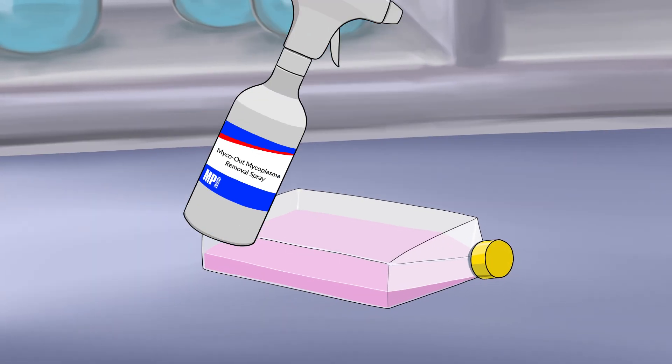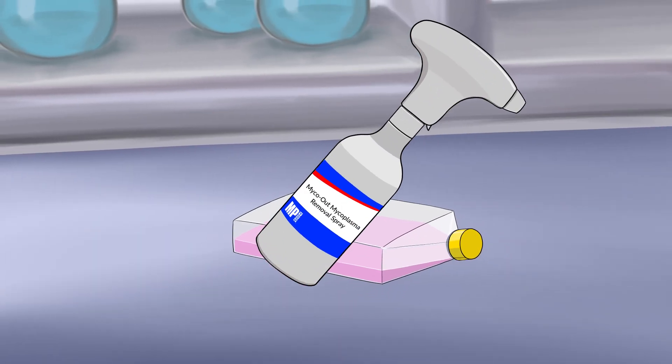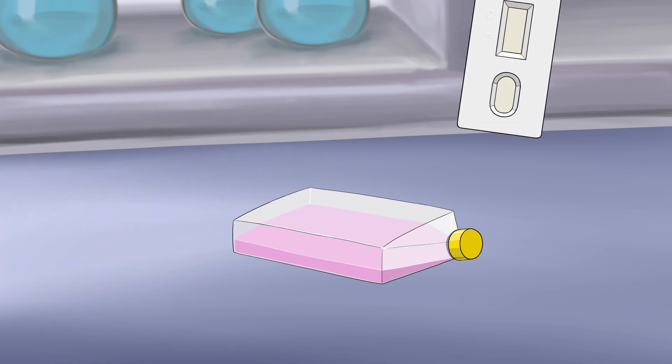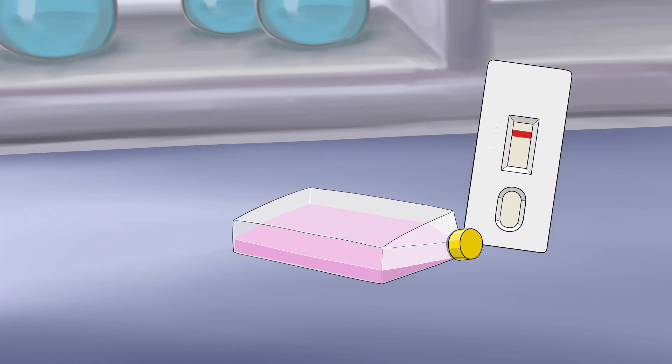Don't forget to always practice good aseptic technique. Prevent mycoplasma contamination using MycoOut Mycoplasma Removal Spray and monitor your cell line regularly for any symptoms relating to mycoplasma contamination.